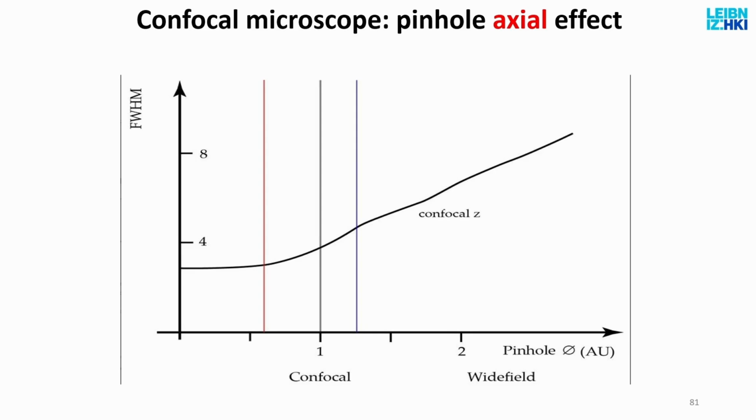It basically means that if you have a wide field microscope where you would have a light source, just a halogen lamp, for example, or laser, doesn't matter, and you illuminate your sample, you get a fluorescent image. Now, if instead of using the homogeneous illumination field, you use a pattern illumination field, let's say a grid like these lines, bright, dark, bright, dark, bright, dark, and I illuminate my sample, of course, then what do I get? I get a stripe image.